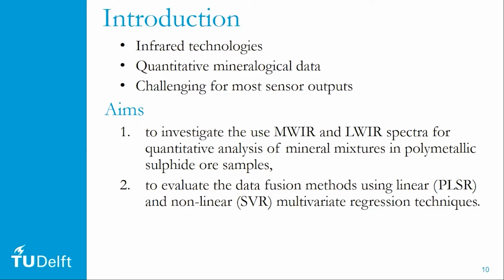Infrared technology is one of the well-established techniques. It's a mineralogical technique that provides information on the functional groups. The technique can be used for identification of a wide variety of minerals. And commonly, it's used for qualitative analysis of materials. And accurate quantitative mineralogical data has significant implications in mining operations and also in geological studies.